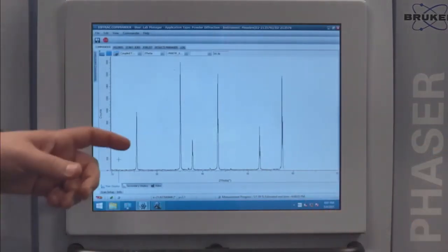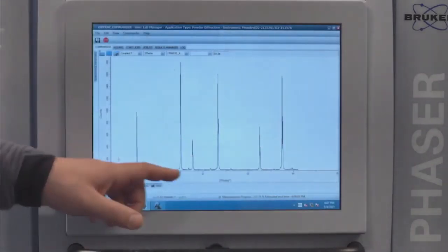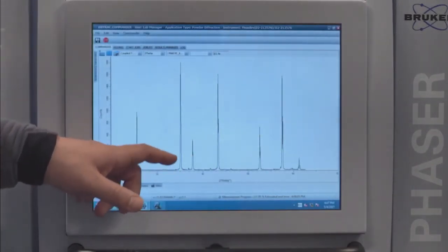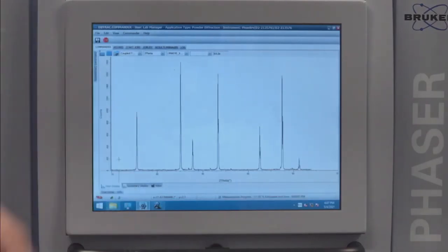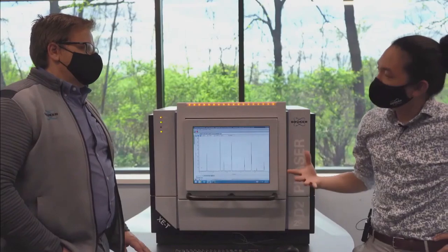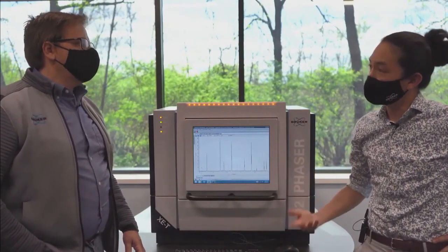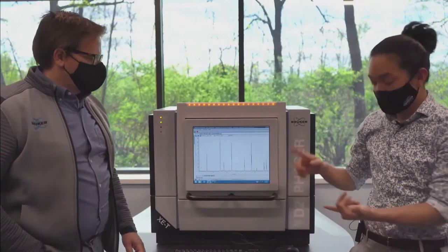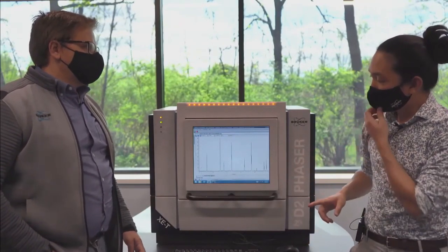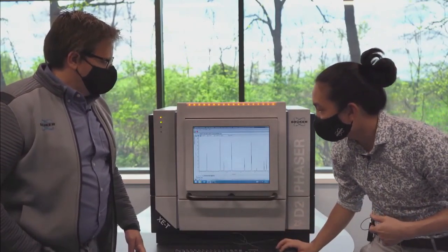Okay. And what I'm noticing is that, like you said, that drop in intensity definitely cleans it up, but it does seem like the signal's a little more jostly, like the noise is a little bit worse. So this is one of the downsides of using the K-beta filter: you lose intensity, you lose counts. So you either need to count longer to gain it back, or you take a hit in terms of things like your total sensitivity, right?